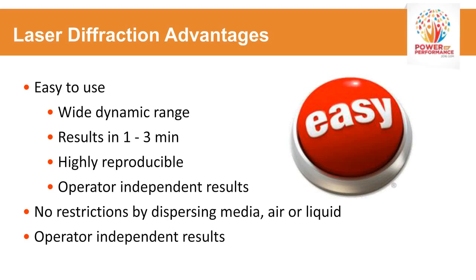The other advantage is these types of instruments are quite reproducible, and also operator independent in the results. These kinds of instrumentation can be run in a dry state or a liquid suspension, such as alcohols or hexane or some other solvent that might be desired. So particle systems can be dispersed in that or run in a totally dry state. And as mentioned above, very important is the operator independent results. The instrument doesn't usually care who's putting the sample in, as long as it's a representative sample. That's really the key for any particle size analysis.